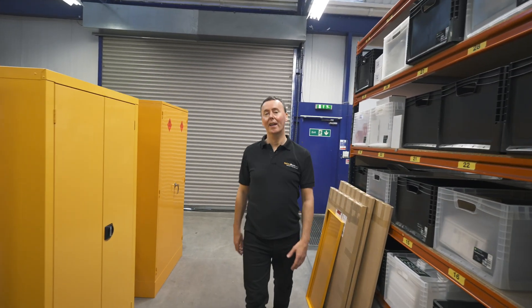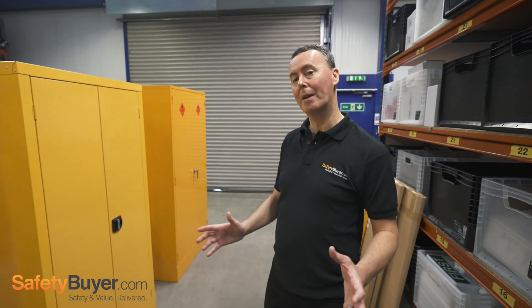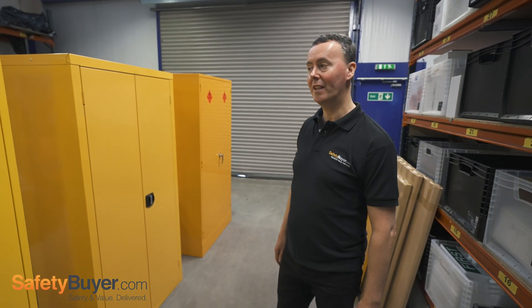Hi, it's Kevin from Safety Buyer. If you've done a risk assessment and are looking to purchase a flammable or hazardous substance cabinet, we wanted to take you through a very short video to show you some of the different types and styles you may find on the internet.